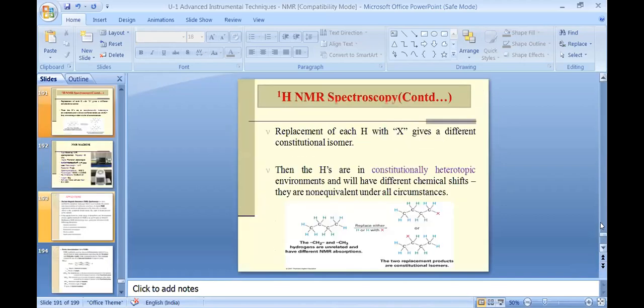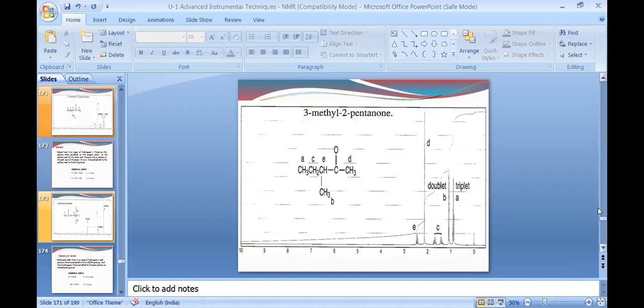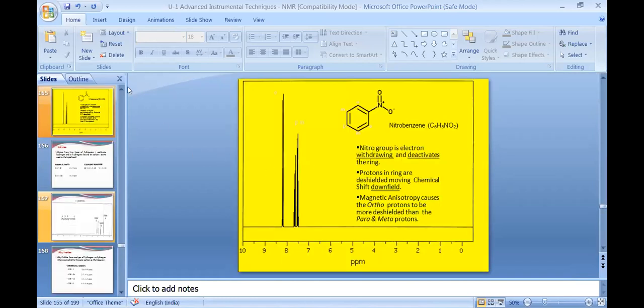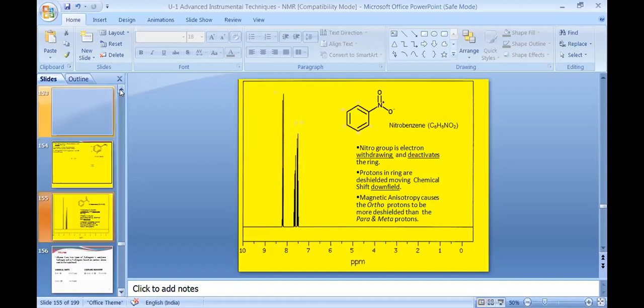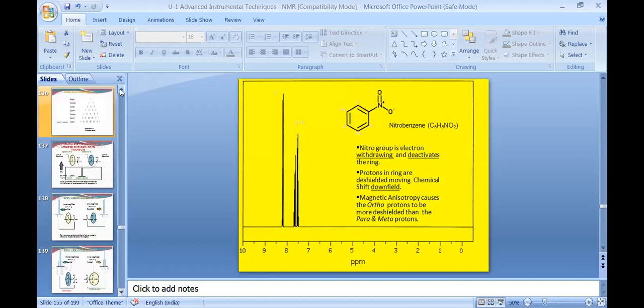I think it will be back. I think we missed this aniline. You can look here, students, I think again in meta you say nitrobenzene.